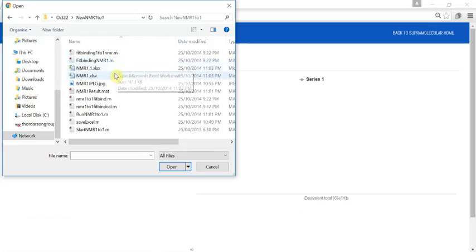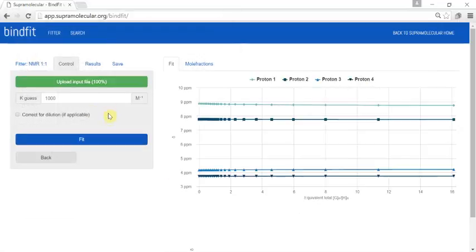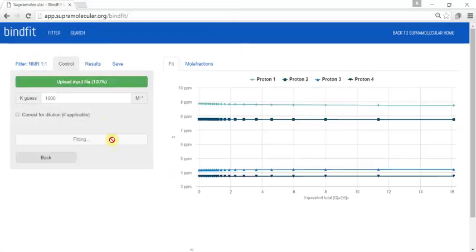You press upload the file and find your file, which is in a simple Excel format. Once it's on the screen you can see the raw data and then you can press fit.